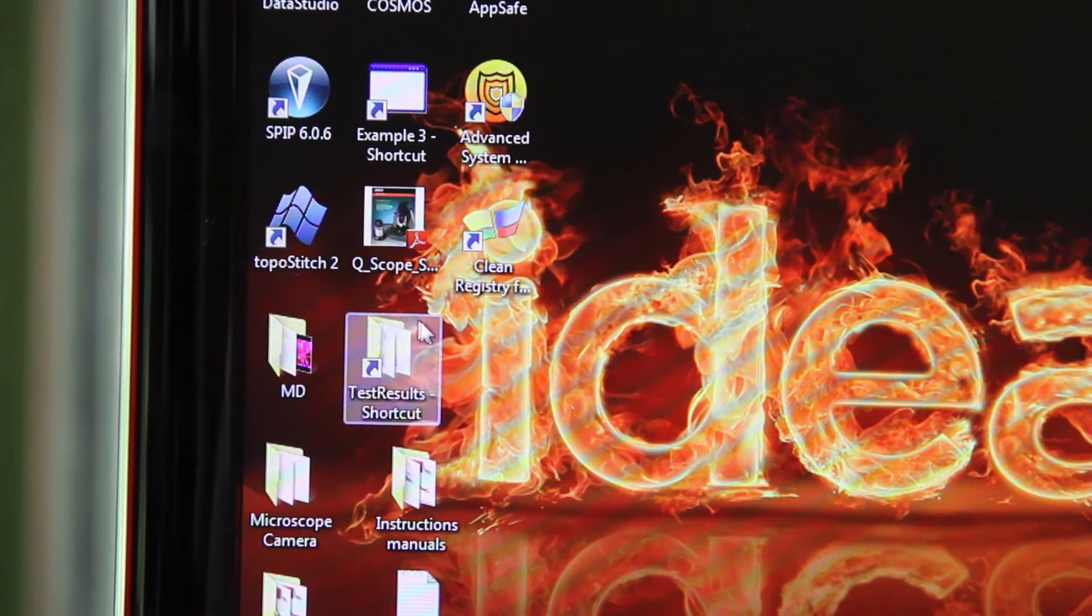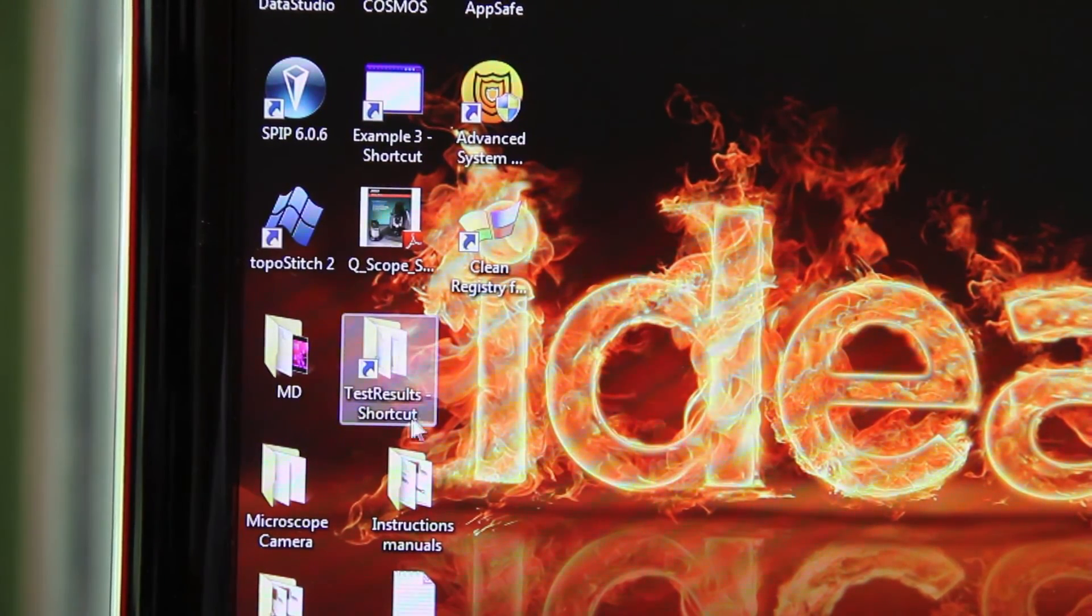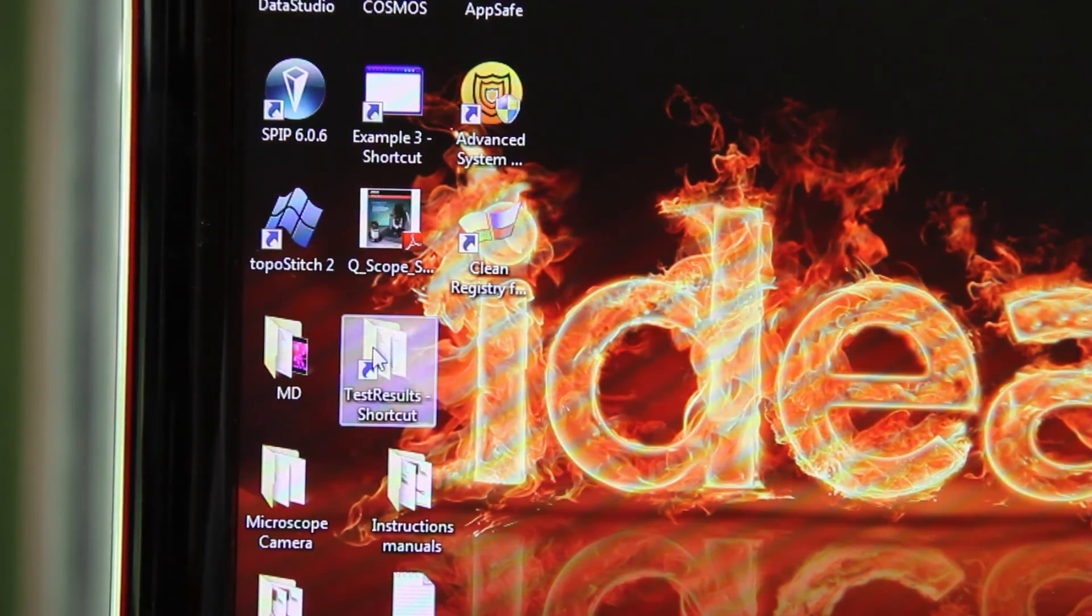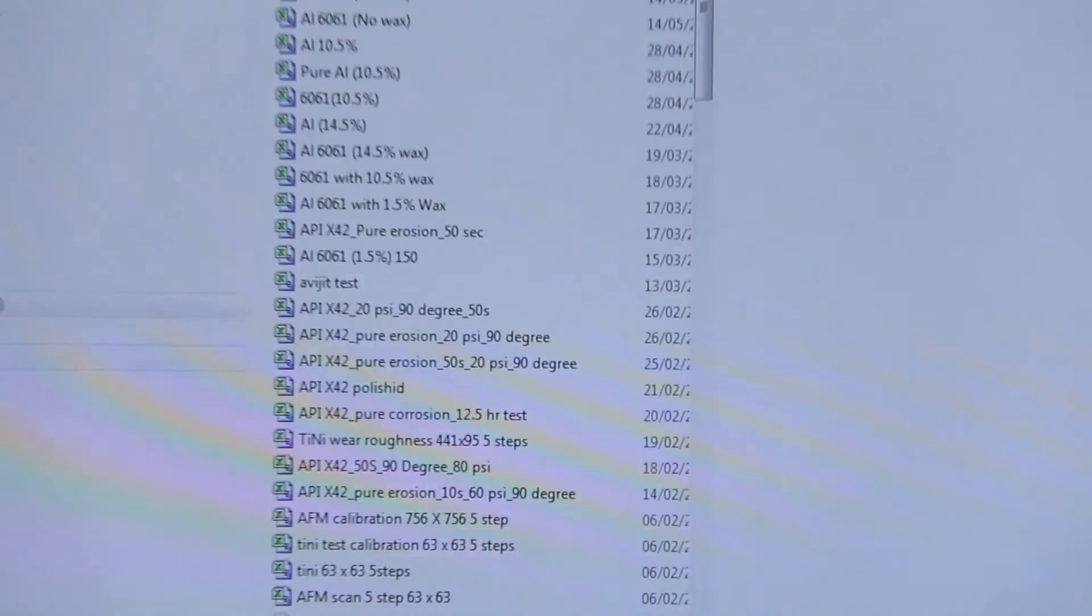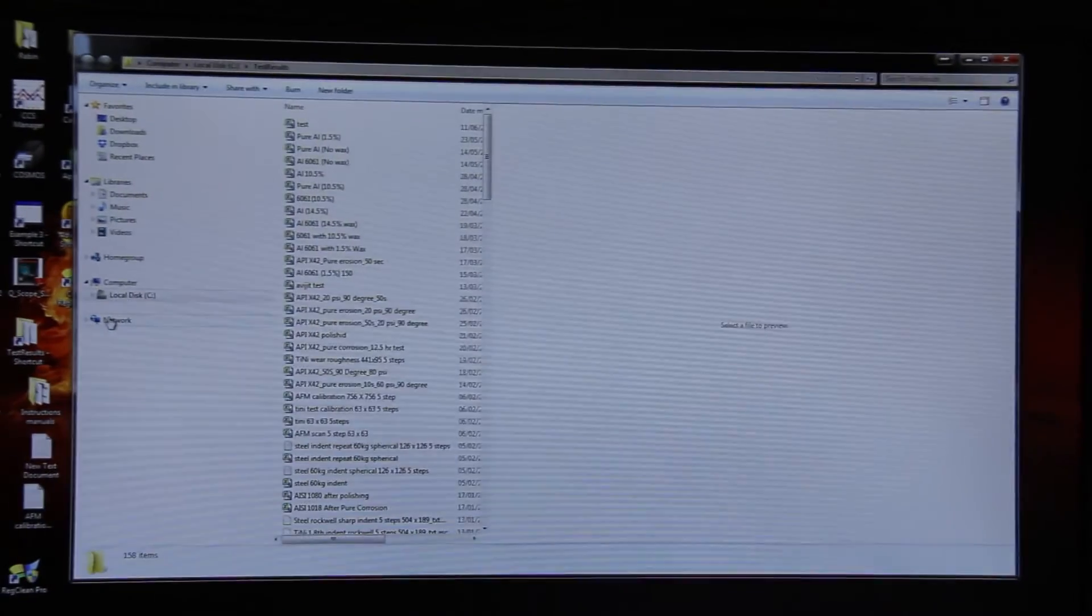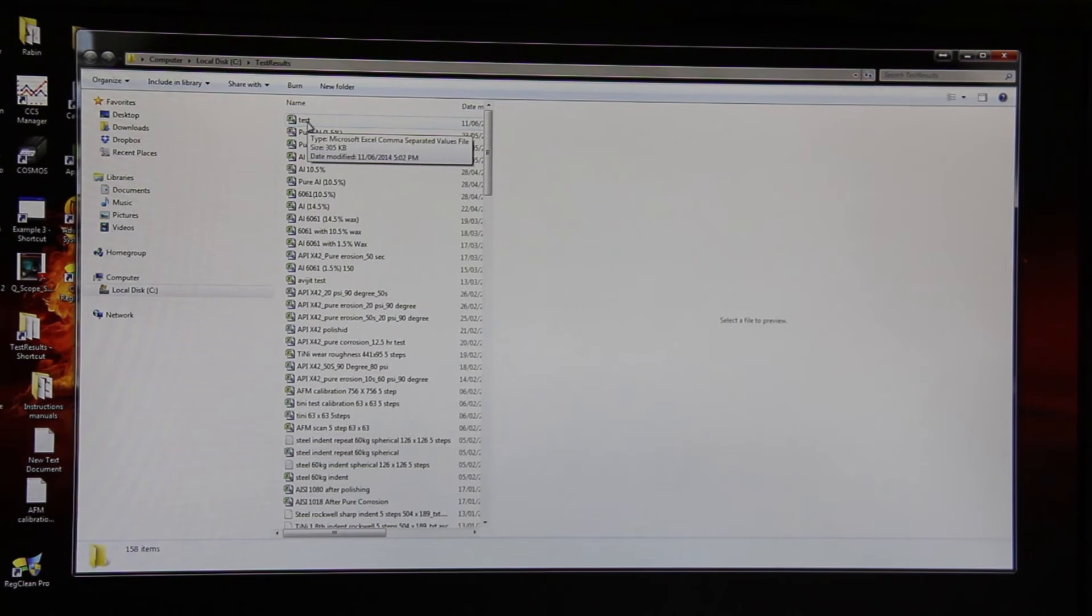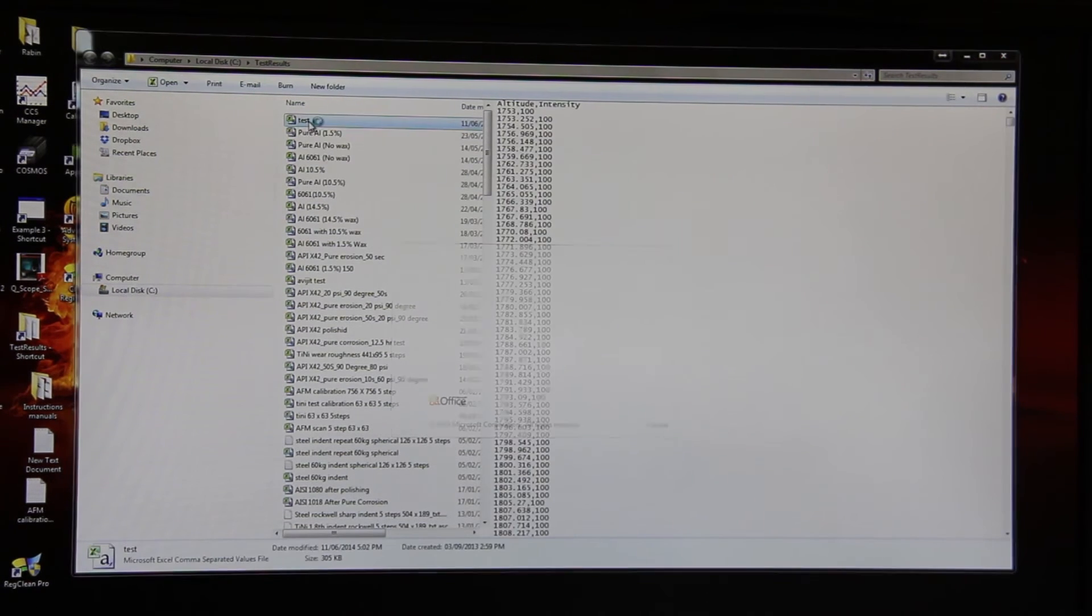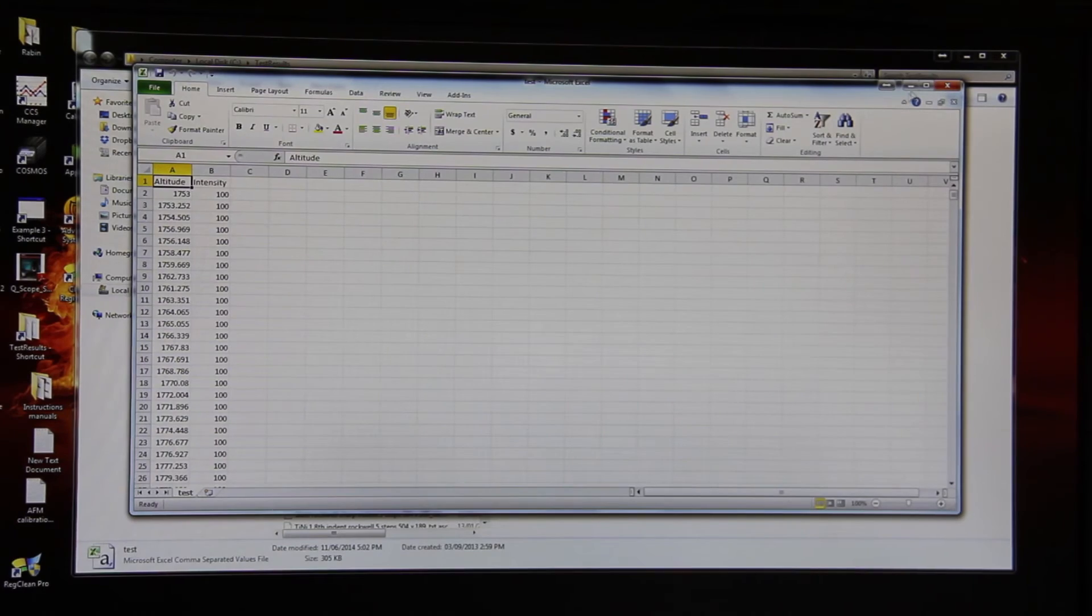All test data will be saved in test results shortcut. Click on this folder. Click on your file. So our file is test. It will be opening Excel.